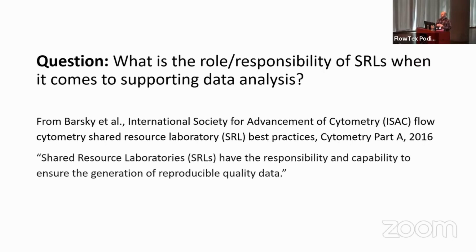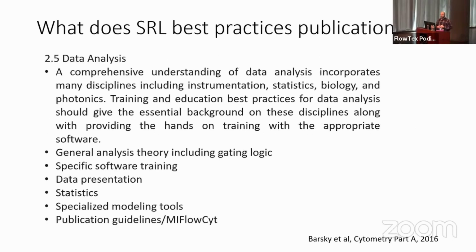Well, is that raw data? Is that how you analyze your data? There's some interpretation there. But the document goes on a little further to mention some things that some of us were completely unaware of. The document says it should include things like general analysis theory for gating logic. We all do that. Specific software training. But then they mention data presentation, statistics, specialized modeling tools. So these things are in that best practices paper that was published 7 years ago now. And I think a lot of us maybe fall short in some of these respects.